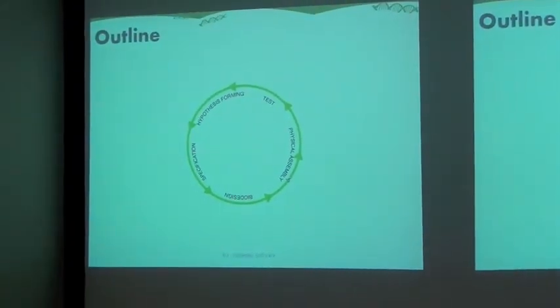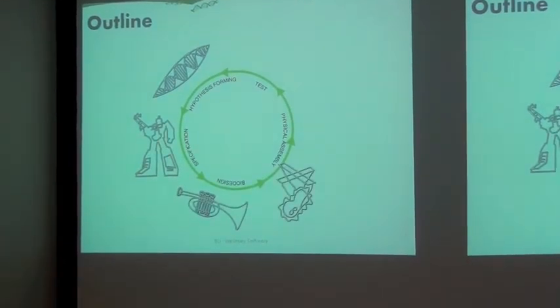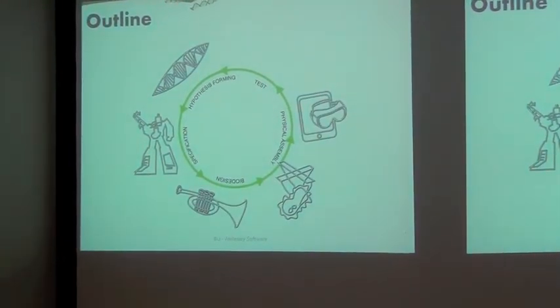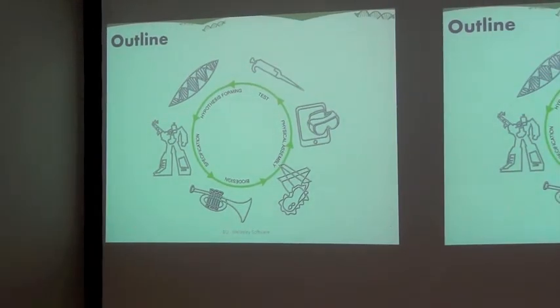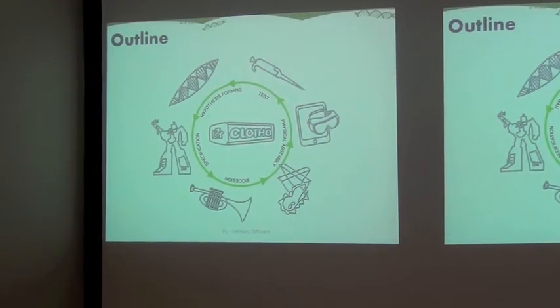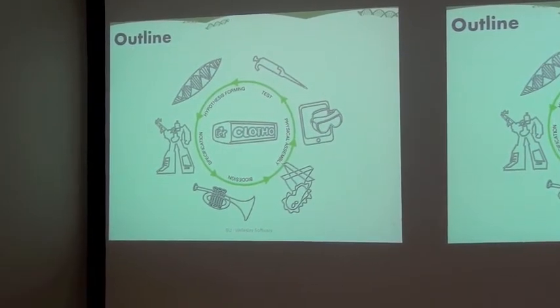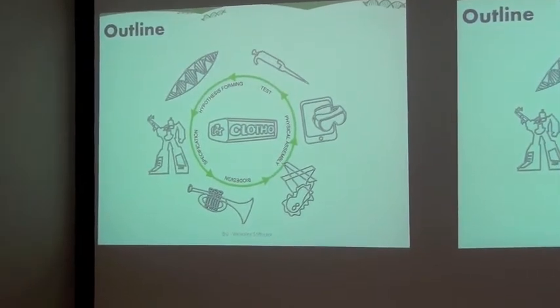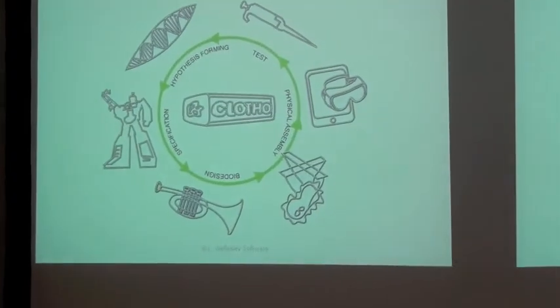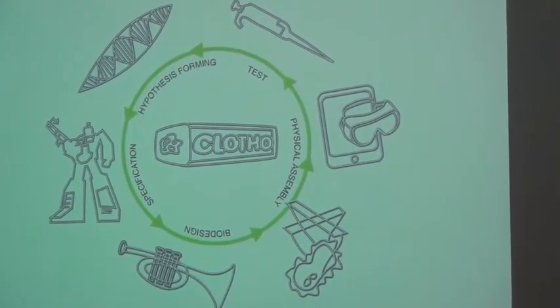During this talk, we're going to talk about 5 different software tools that we created over the summer. Afterwards, we're going to talk about how those tools were actually applied in the wet lab portion of our team and what feedback they had about those tools. The thing that unifies all of these tools is Clotho, a data management tool unified by a core data model. This tool was created by Doug Densmore's iGEM teams in 2008 and 2009. If you want to find out more information about it, you can check out our wiki. We have links to all of that information.